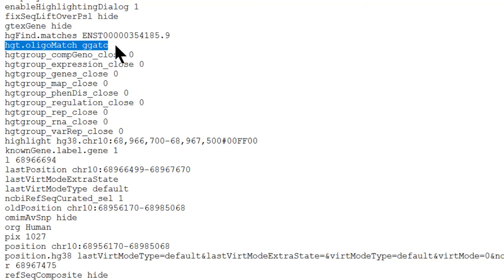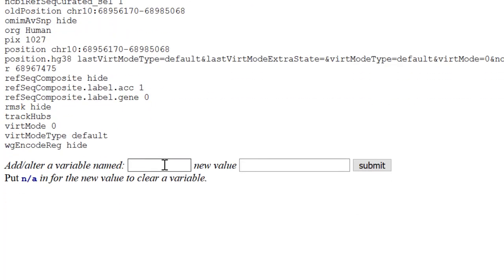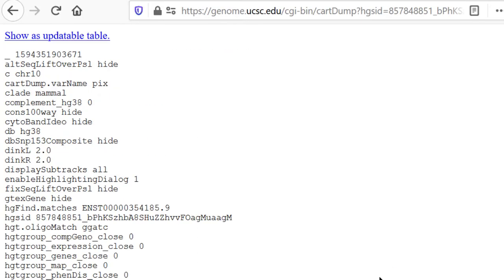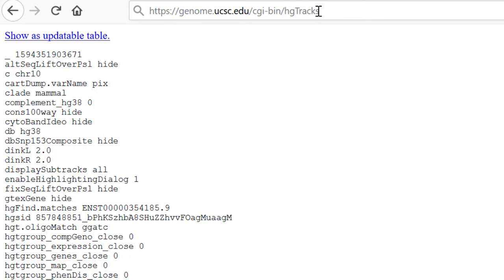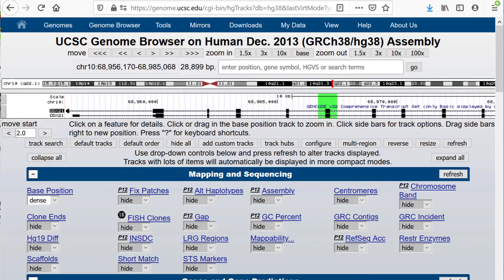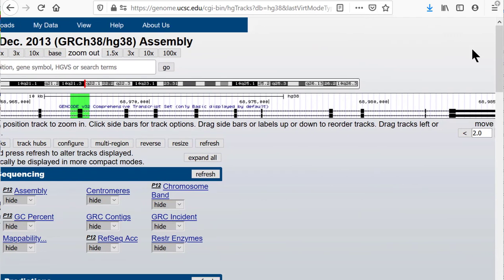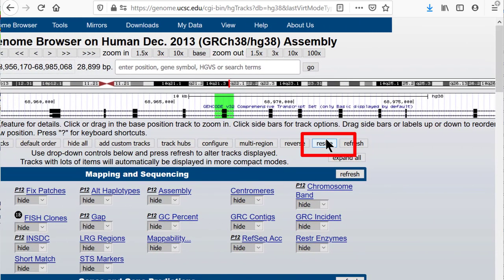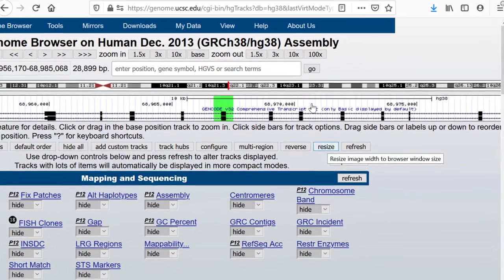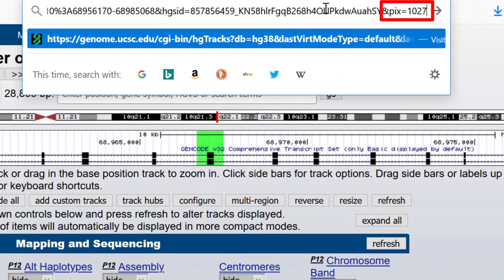You can experiment with the variables right at the bottom of the cart dump page and see what they do. An obvious one is Pix — let's set it to 1600, which will be pretty obvious back on the graphic, and submit. To get back to the graphic, hack the URL by adding hgtracks after the CGI bin in the URL. All of the parameters seen in cart dump will be used to configure the graphic, and you can see that the image is indeed really wide. We can reset the window using the resize button below the browser graphic, or set it with the URL using ampersand pix equals 1027 appended to the URL.